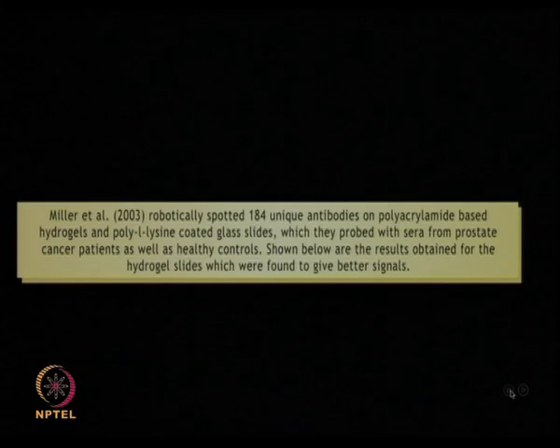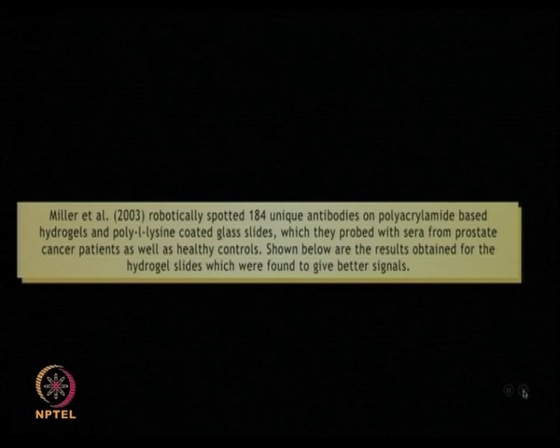Authors used robotically spotted 184 unique antibodies on polyacrylamide based hydrogels and poly-L-lysine coated glass slides. These slides were probed with the sera obtained from the prostate cancer patients and healthy controls. Now, let me use this interactive animation and show you the results obtained for the hydrogel slides.